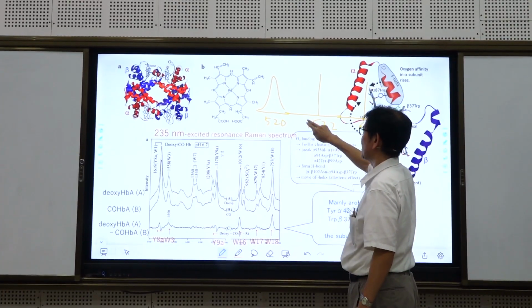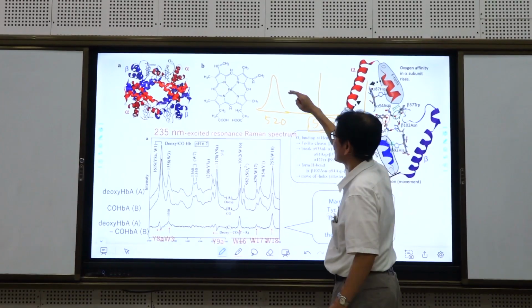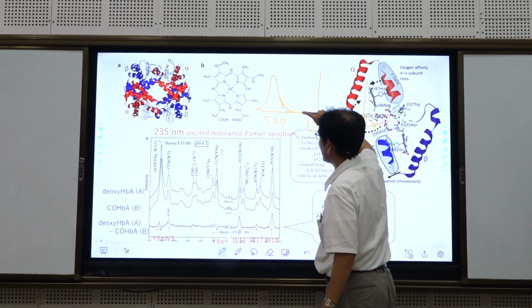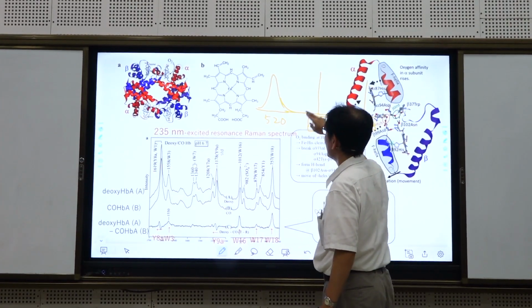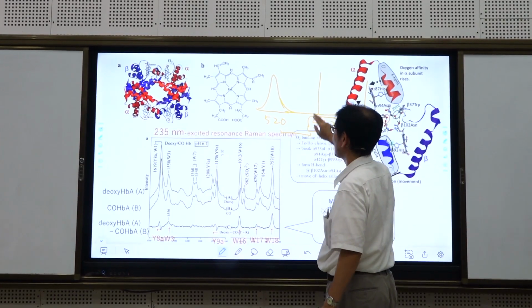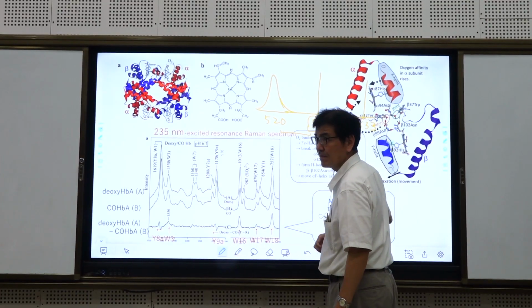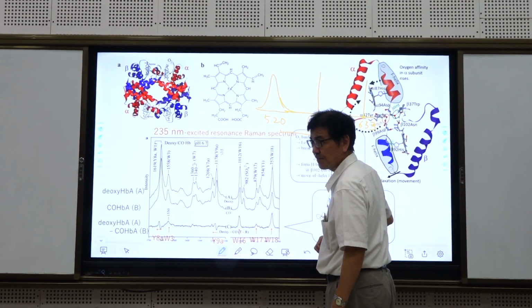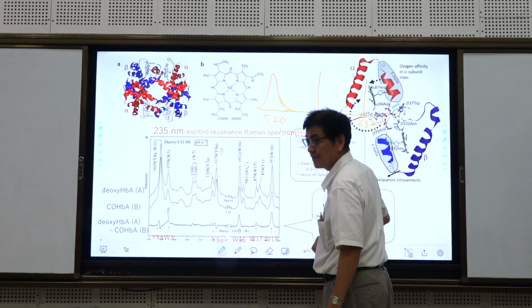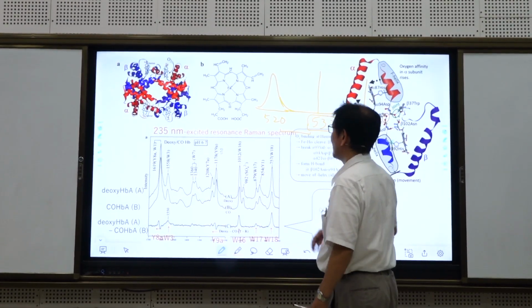So probably this one is more useful, because the absorption band spreads. If the energy difference is closer, then if we excite at 532 nanometers, there is a greater chance of getting fluorescence background because it is in the absorbance range of that molecule.